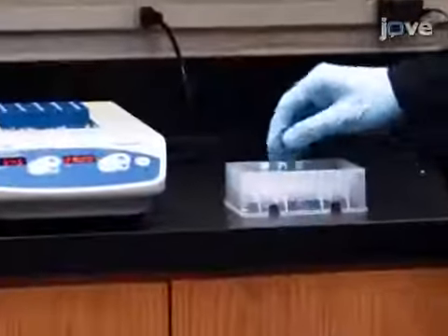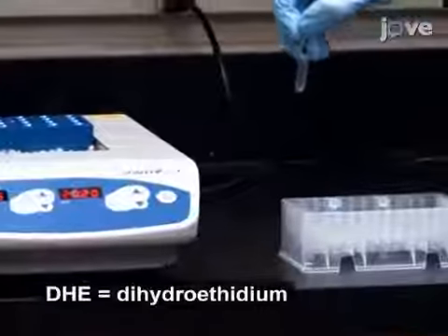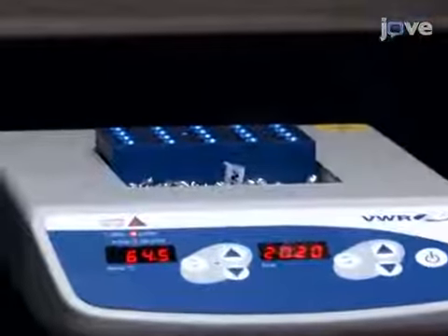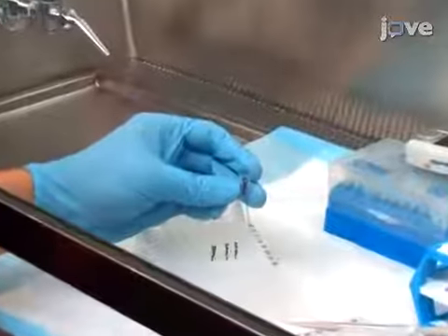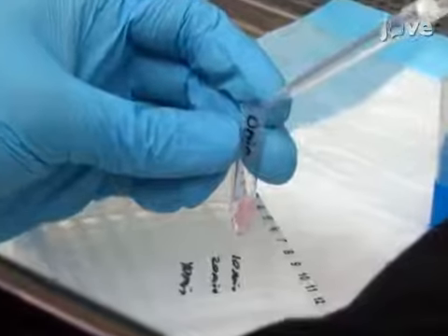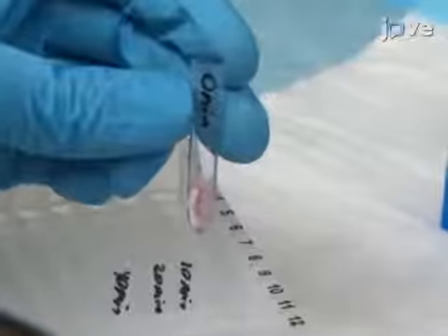Upon obtaining the peripheral blood sample, thaw the S. aureus bioparticles and DHE at room temperature and N-ethylmaleimide in a 37 degrees Celsius bead bath. When the reagents have thawed, add 20 microliters of the S. aureus bioparticles to 4 individual 1.2 milliliter tubes within a sterile hood.